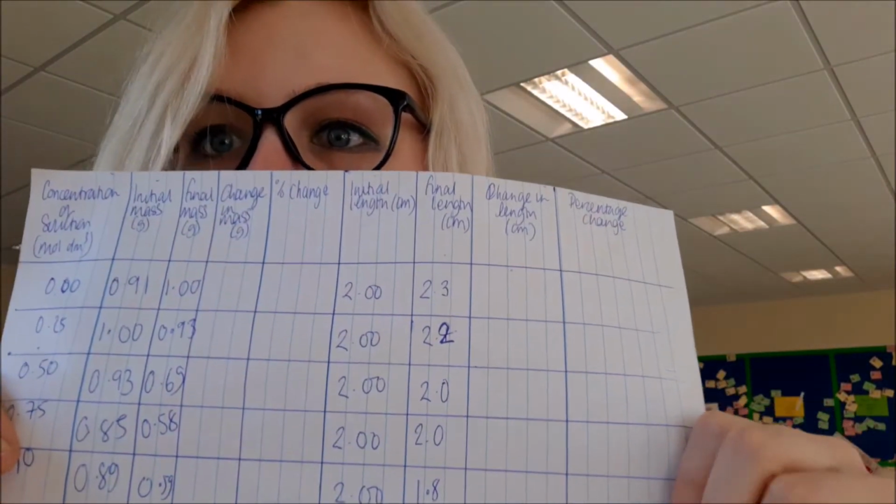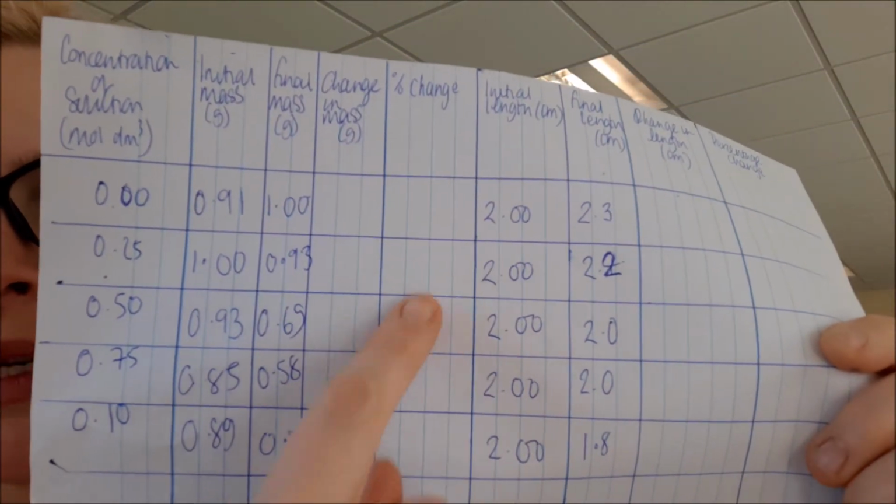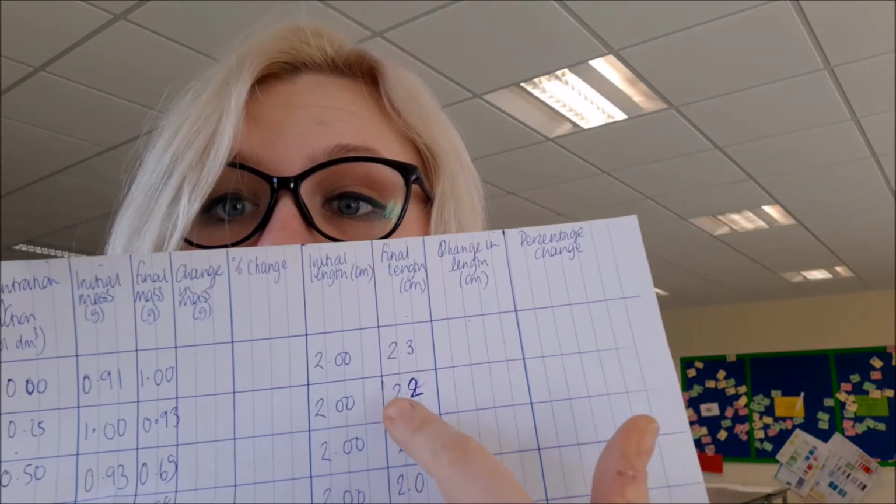So now I have some results. Now what I need to do is calculate change in mass and then the percentage change. I do the percentage change by doing the change in mass divided by the initial mass and times that by 100, and that will give me the total percentage change. I can do the same for the length, but there isn't a huge amount of variation in length, so I'm actually only going to plot the percentage change in mass on a graph. And we can use that then to work out what the concentration of an isotonic solution would be. So what concentration of solution is in those cells, which is pretty cool.